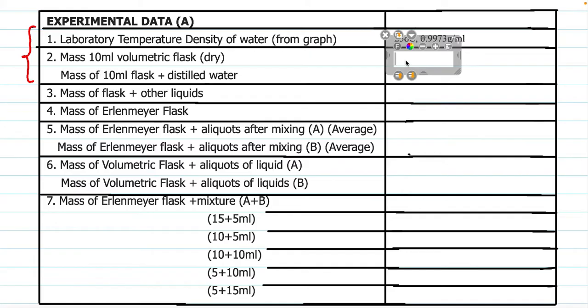So I'm going to be using, because I saw this from people that carried out the experiment, 16.1 grams. All right, but if your value is within the range of, let's say, 13.5 to 17.5, you have nothing to worry about. You're still within the right data.